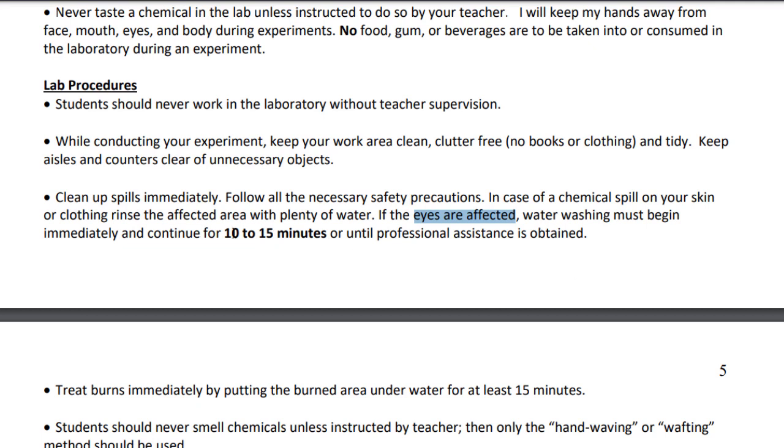So 10 to 15 minutes is the minimum if you know you've got some kind of a chemical like that on you. The problem with the eyes is that you're going to have to hold your eyes open and put them into the eye wash station for that amount of time and have the water flushing your eyes. Very uncomfortable. I'll show you when you guys get in here how to do that. But this number here is important to remember for your first quiz, 10 to 15 minutes or until you can get proper help. Okay, so you just keep going until the emergency people arrive.